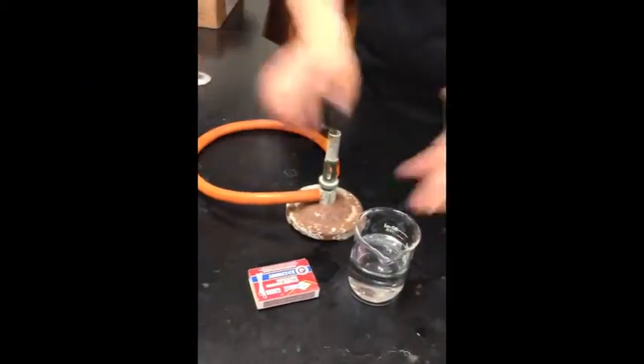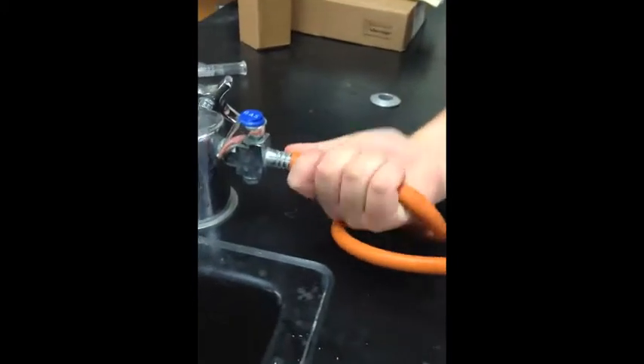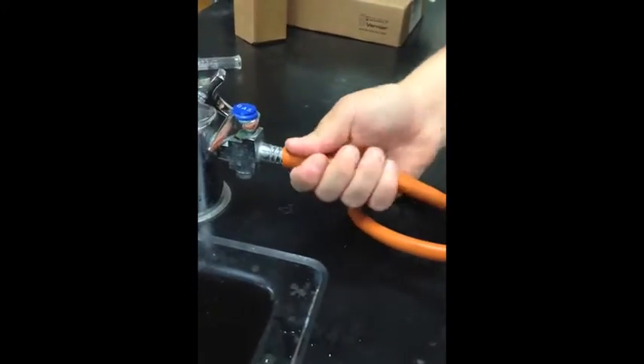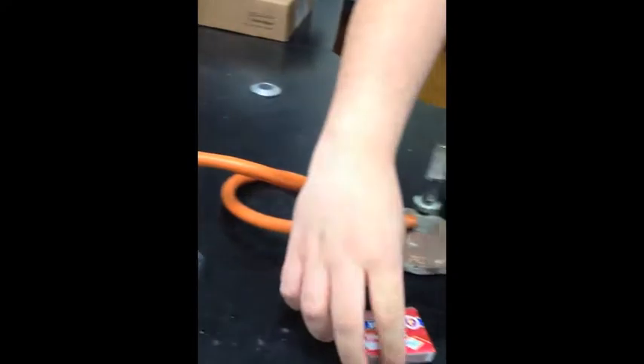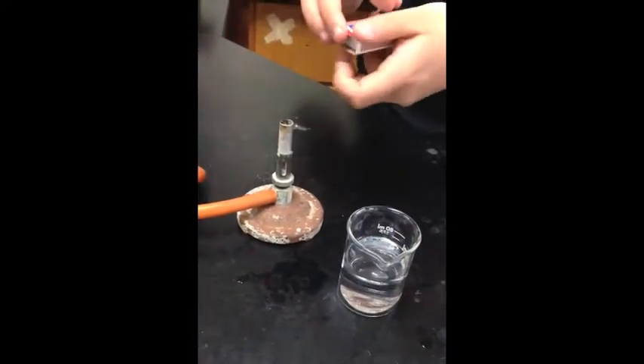Before lighting the Bunsen burner, make sure you have all your supplies. Place the tube into the gas jet. After you put that in tightly, light the match first before turning the gas on.